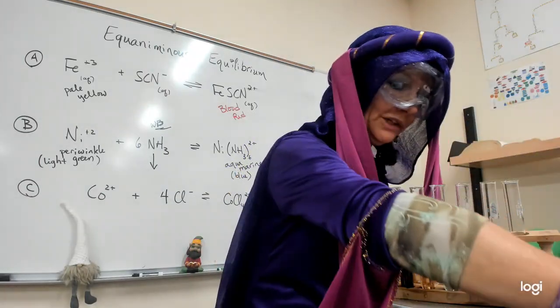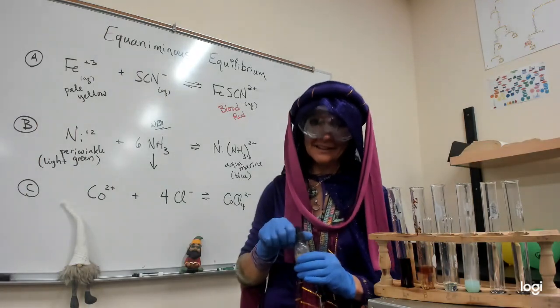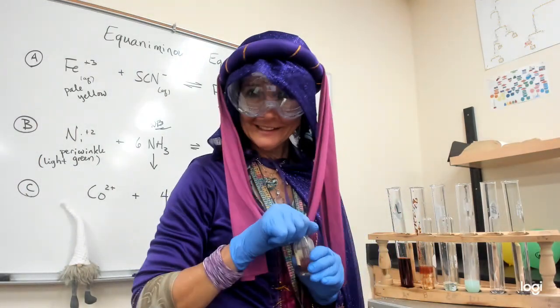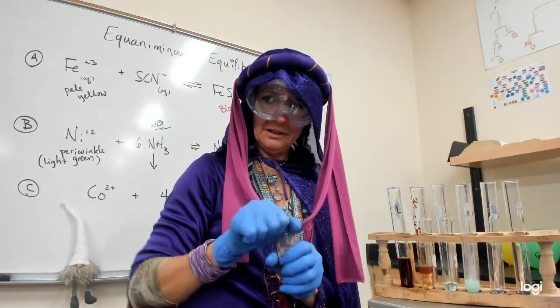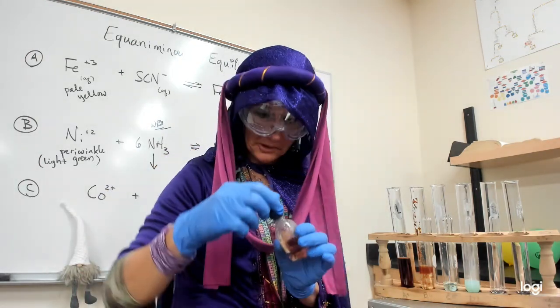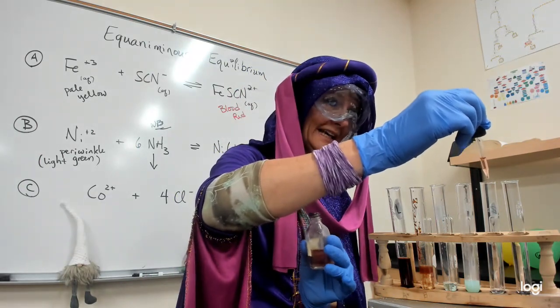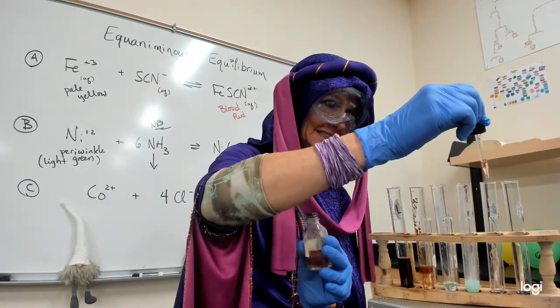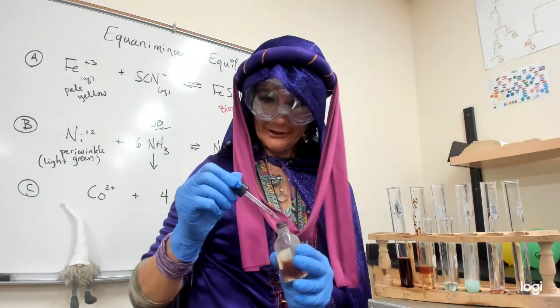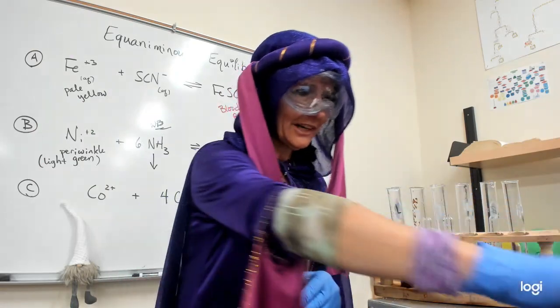All right, one more. Ready? Gnomes are here. The gnomes are very sad because this is our last day in lab together. Oh, but some of you will be with me next term. And maybe we'll finally, so we're going to add, I didn't read the instructions, how many drops. Does anybody count? You can put me back in slow motion, see if I added the right amount.